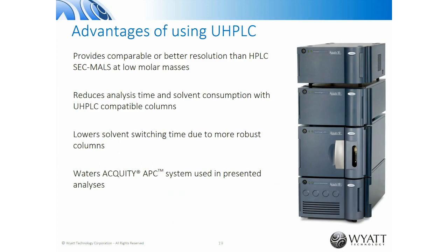Thank you, Dr. Trainoff. So we've designed this viscometer to be used with UHPLC. Some of you might be wondering, why would we want to use UHPLC versus HPLC? And there are several advantages.